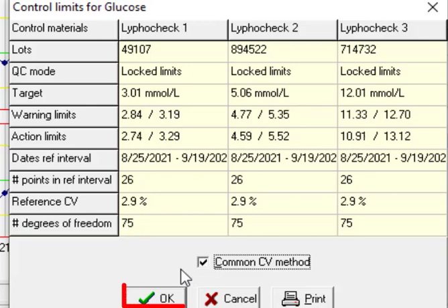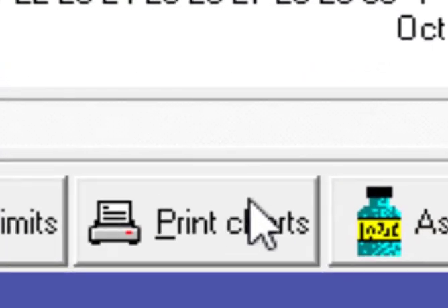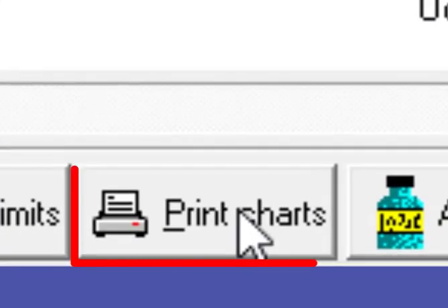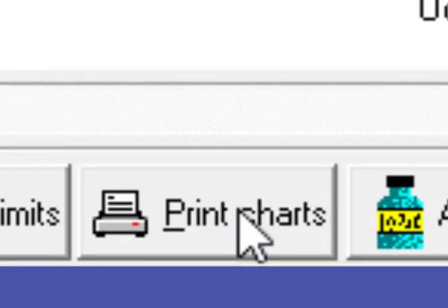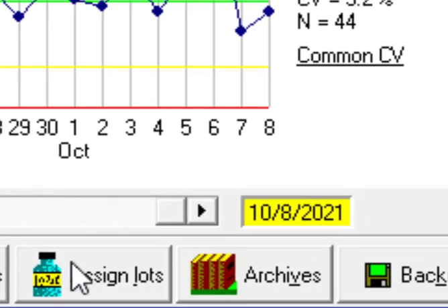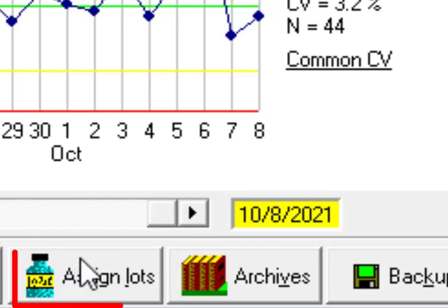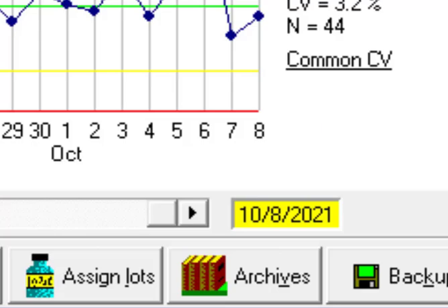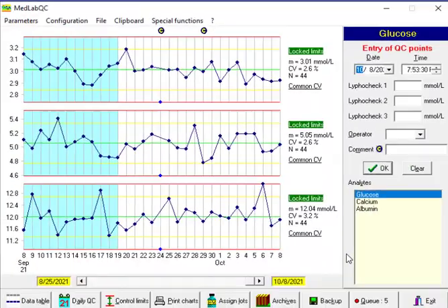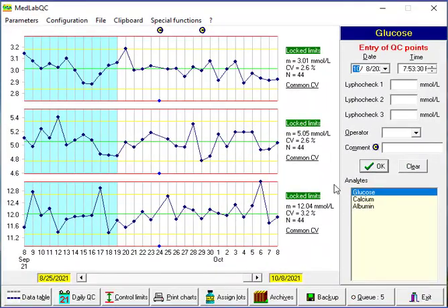Press OK. We can print these charts. You can assign a lot to each level of control for analyte. We can archive them.